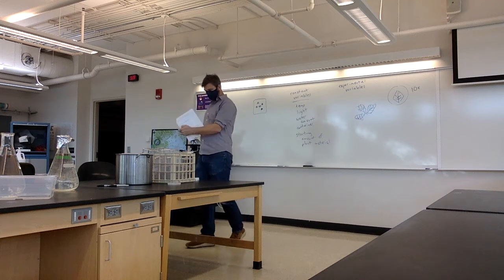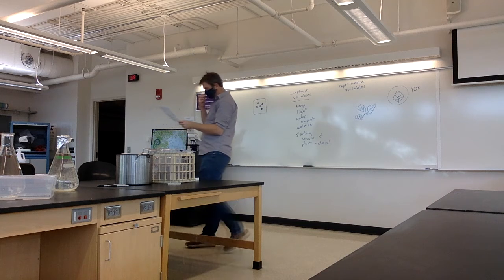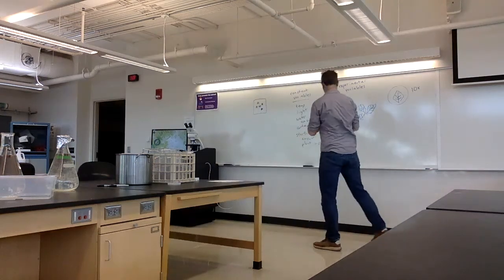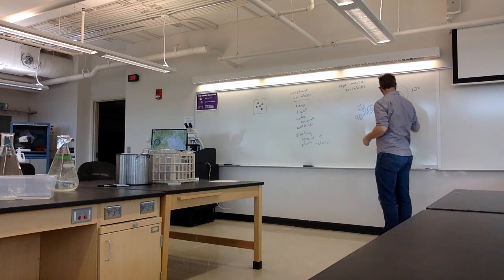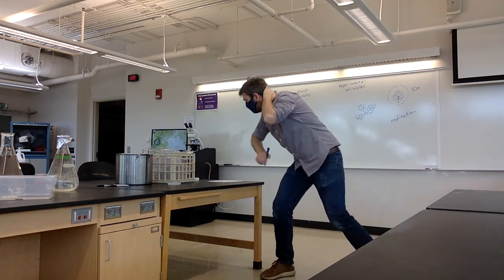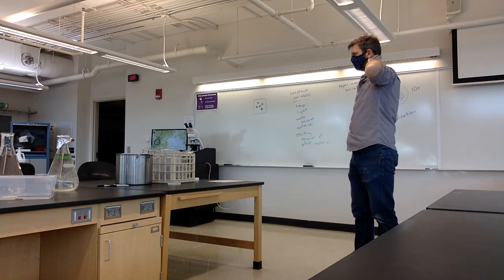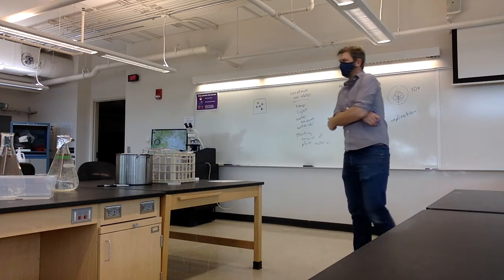Okay, what do we record for the starting point? What do we want to investigate? How do we set up an experiment? I guess one last thing we didn't talk about is replication. So I don't remember how many of these I have. Got at least 50 of the growth chambers, and I can get more. So we have 4 treatments, 4 people in the room right now.